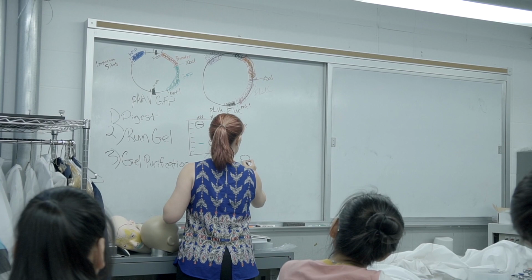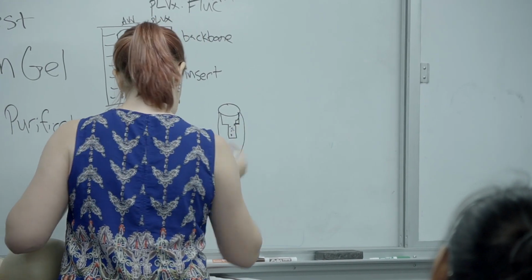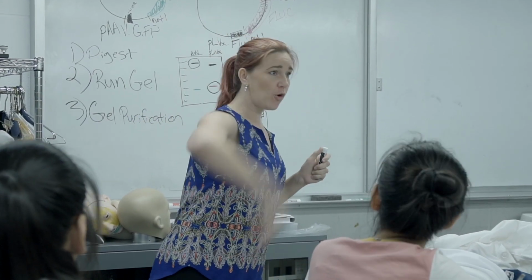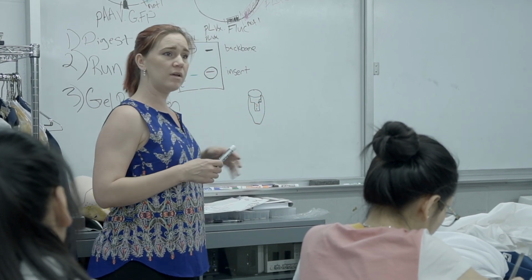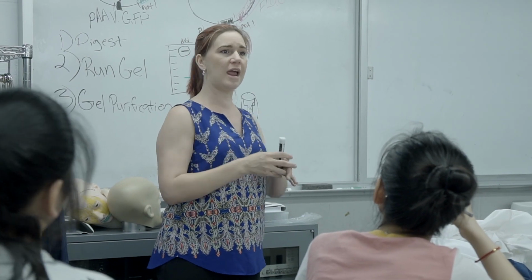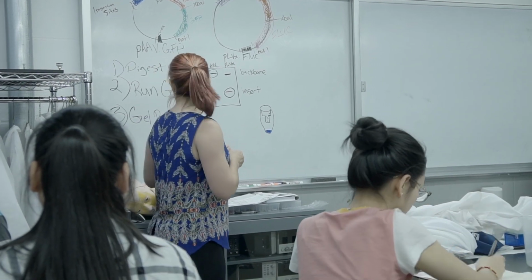They're essentially, they look kind of like this, and they sit in a bigger Eppendorf tube. And inside here is filled with a bunch of material that when you have the right pH, your DNA will stick to it, and then you spin it really fast and you force all the liquids through that column, and the DNA is going to stick to your column, and all the junk gets washed out. And then after you've washed through this several times and cleaned it, at the very end, you'll put a special salt buffer into that that's going to release all your DNA, and your DNA just ends up as a purified liquid at the bottom, usually around 30 microliters. And you'll have a whole bunch of DNA in there.